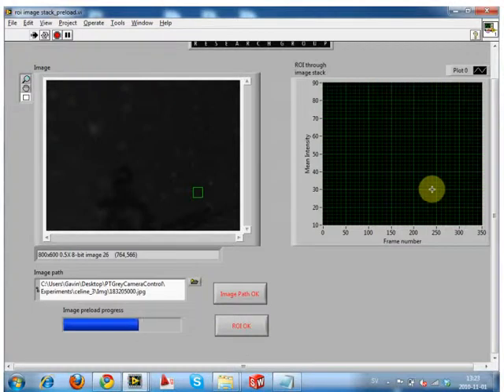With this new VI that you can use, you can actually replace it in your other programs. If you replace it in, it should work as written, and you shouldn't get these little pops. It should have cleared them out and reordered them in the right way. If this thing speeds up a little bit, we'll be able to show the error. Come on.